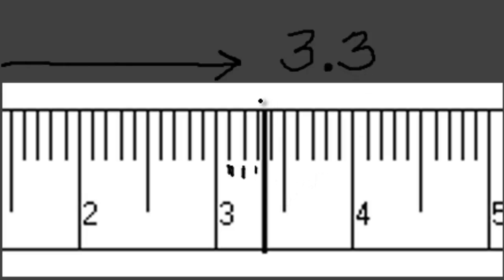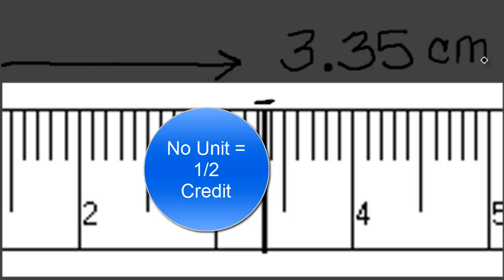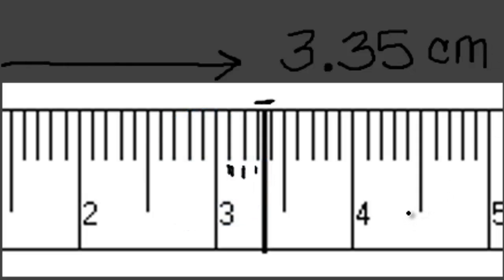Now I have to estimate. So in between here, where does that look to be? Well, to me it looks like it's exactly in the middle. So I am going to put a 5. And again, for full credit, I need to put centimeters. You'll have plenty more practice with this in class the next day.